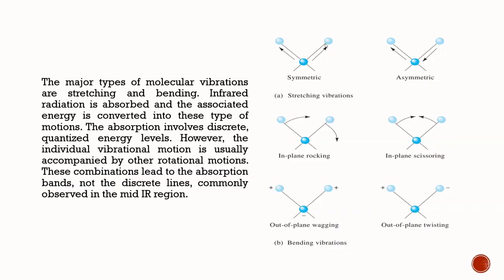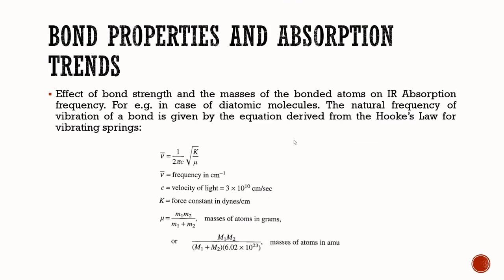But the bond length varies. Whereas in bending vibrations, the bond angle varies, but the bond length will remain the same. Bond properties and absorption trends.